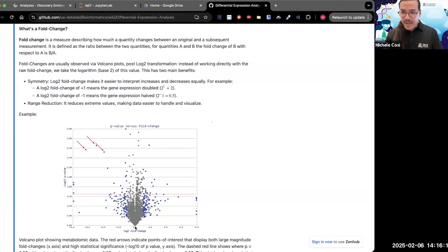Is there a gold standard threshold setting in the aspects of a bioinformatician? I will say I'm not sure if there is a gold standard. From my understanding, it varies between samples themselves.